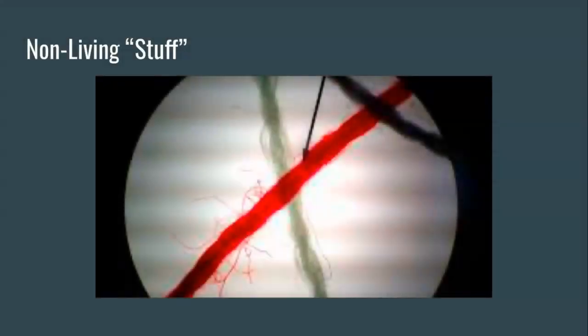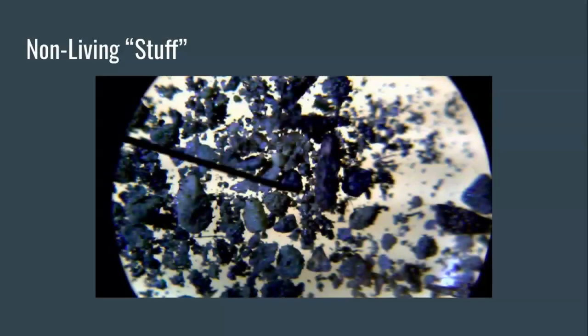Here again is something that kind of looks like a cell. It looks transparent, you can see through it, but I'm noticing that it doesn't have the dark border, and there's none of those organelles or little bits inside of it like cells have. In fact, this is just string under a microscope. Finally, here's some dirt. It might have some repeating shapes, but notice how the light cannot go through it, and that's a pretty telltale sign that you're not looking at cells.